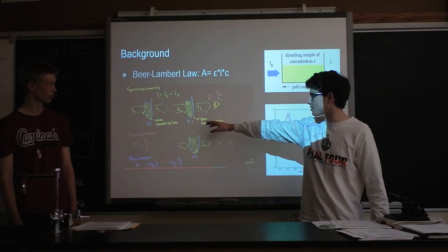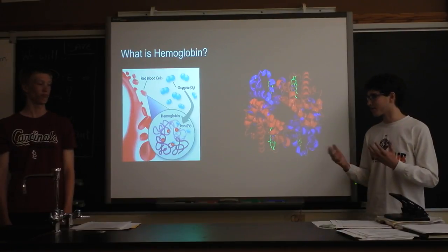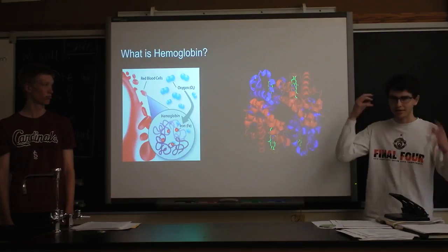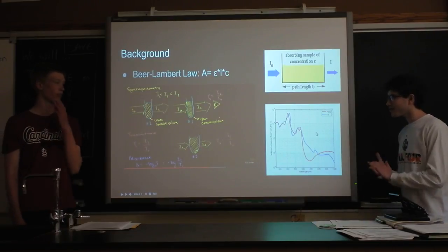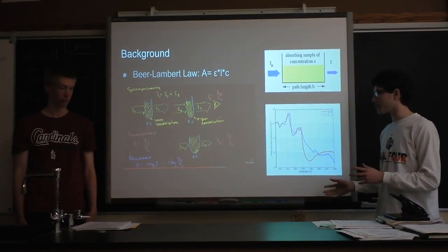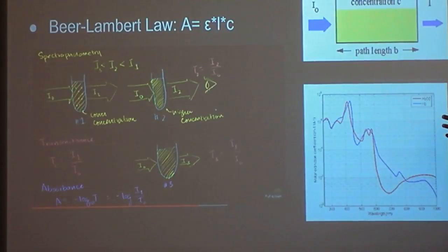All right, so first, if anybody doesn't know what hemoglobin is, it's the stuff that can carry oxygen. For the most part, it carries oxygen through your blood into your lungs and your brain, and lets you function. So, some background. Basically, there's one principle that this experiment uses, and it's the Beer-Lambert law, which says that absorbance is equal to the molar absorptivity coefficient.